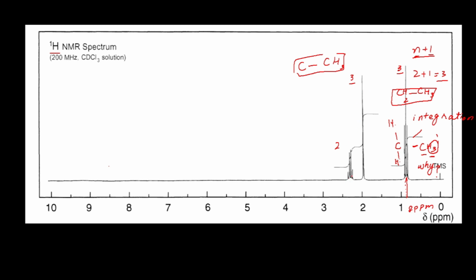Okay, so this is the information that I got from this peak, and this is the last peak, and you may see this is the quartet. Quartet means that there are 2 protons present, as you may see from the integration value. And if this is the one kind of proton, it means this is 1 plus n, where n means 3.